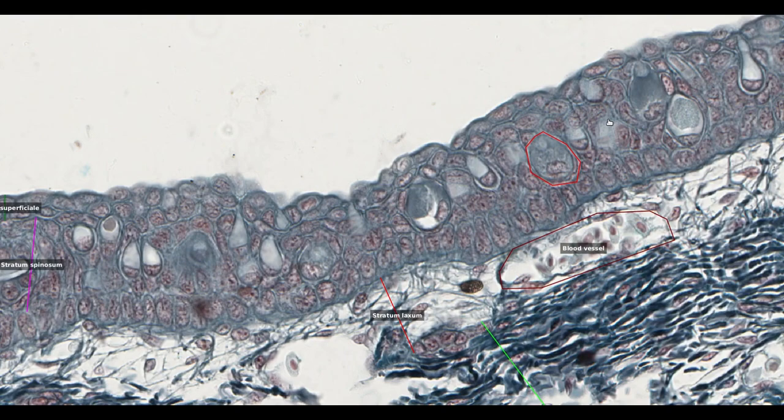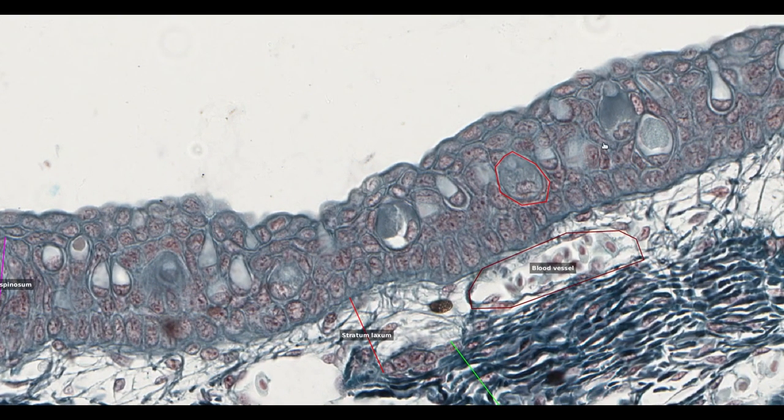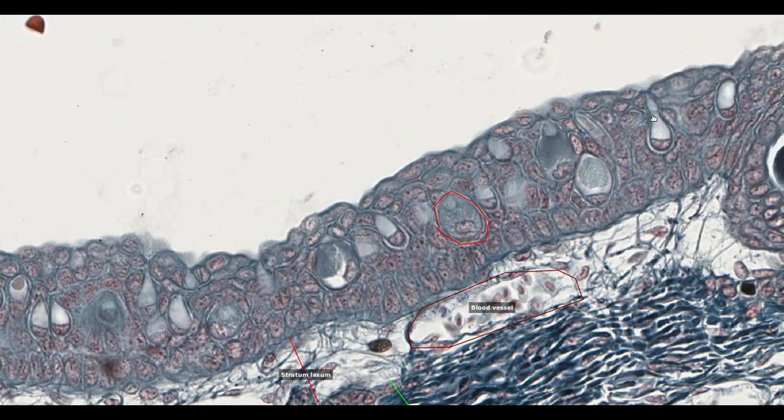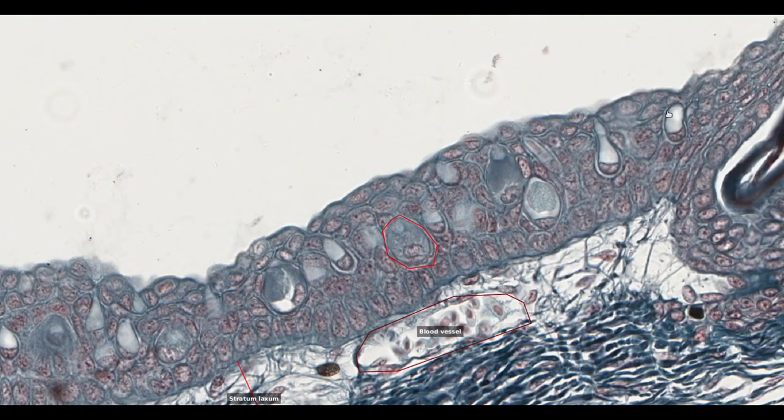In one paper I found reference to specialized holocrine cells. Holocrine cells are secretory cells which release their contents by rupturing their cell membranes, destroying themselves in the process. An example in mammals is the sebaceous glands. It's possible that these larger cells with foamy cytoplasm are holocrine cells. Wherever they come from, the secretions covering the shark skin will help to defend against bacterial and parasitic infection.